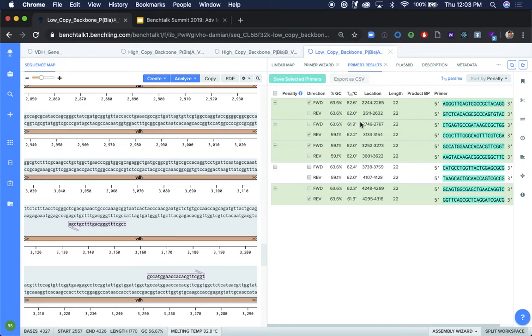So what have we done? We've imported our sequences into Benchling, we've codon optimized them, we've added some to a work list, we've gone to the bulk assembly tool, and assembled all of these vectors. We attached sequencing primers there and designed new ones to cover regions that didn't have coverage. You can imagine going to the bench, prepping these samples, miniprep samples, for example, for sequencing. And then you might submit to a CRO or to a sequencing core, or you are the sequencing core, and you want to now visualize the alignments to confirm that you've made at the bench what you intended to make.